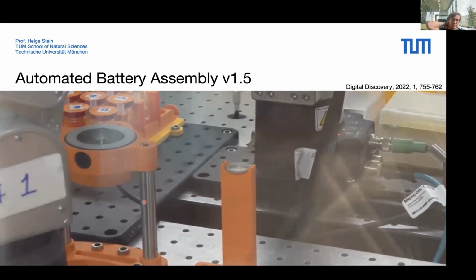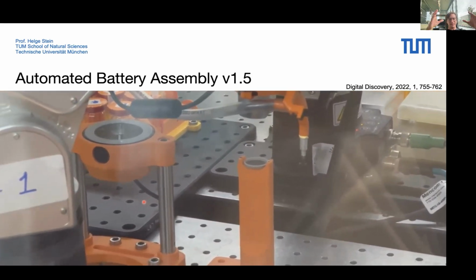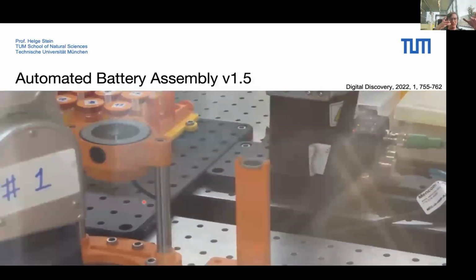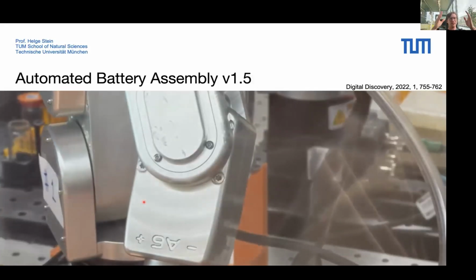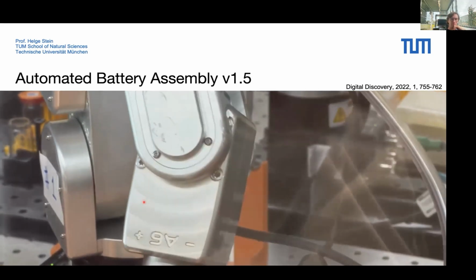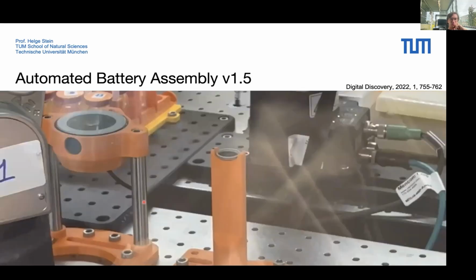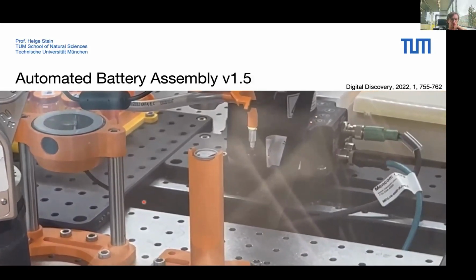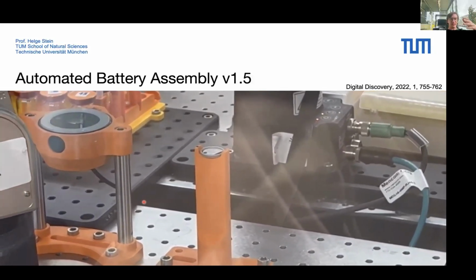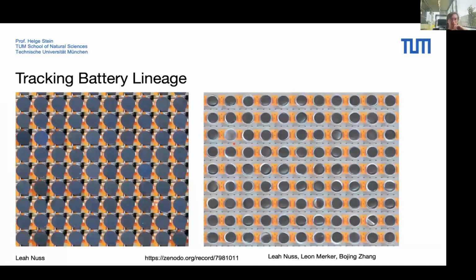So here you see it again. It takes the picture, it then fits a circle to the image, and then it pushes the robot by a few micrometers left and right, so that you always center the electrodes on top of each other. Now, you can also see in the background there's a small pipetting robot that can formulate an electrolyte from some stock solutions, and then dispense it onto the cell.